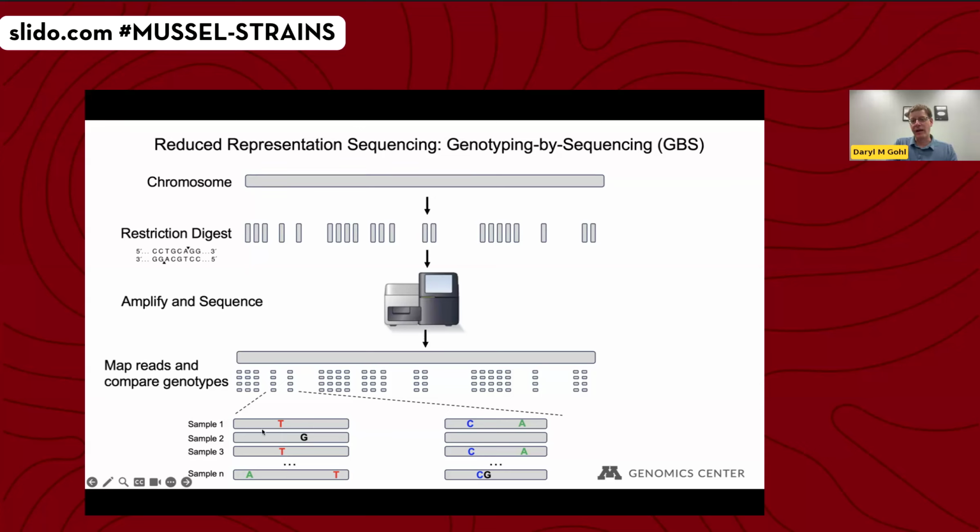Anything in gray matches that reference sequence, whereas the bases indicated here, the T's and G's and C's and A's, would be deviations from the reference sequence. So these are variants that may be unique to that specific sample, or not unique, but differ from the reference sequence. These are referred to as variants, or sometimes single nucleotide polymorphisms, or SNPs. So you might hear me using those terms interchangeably throughout the talk.